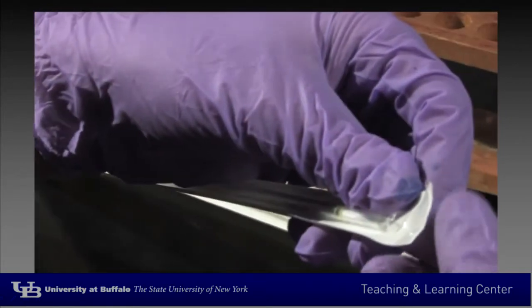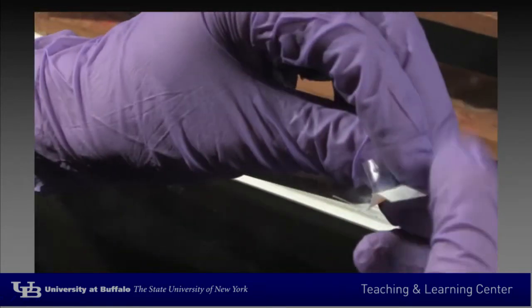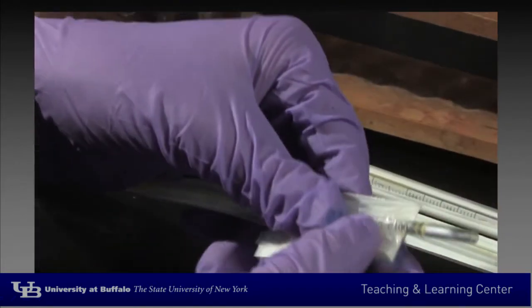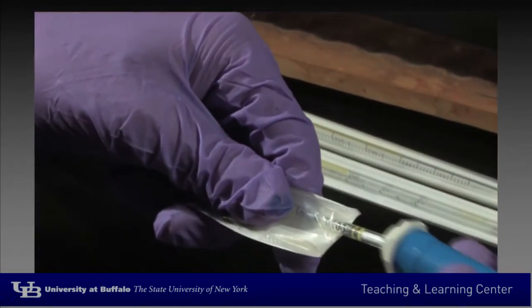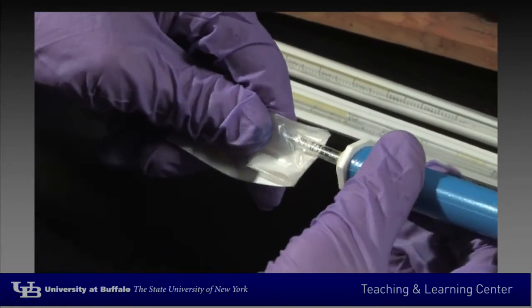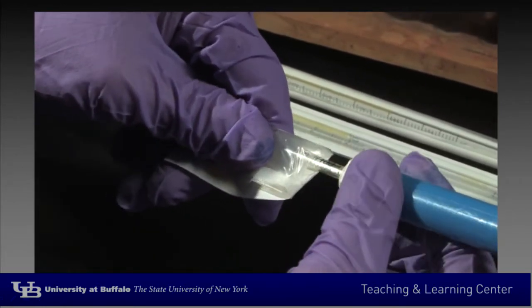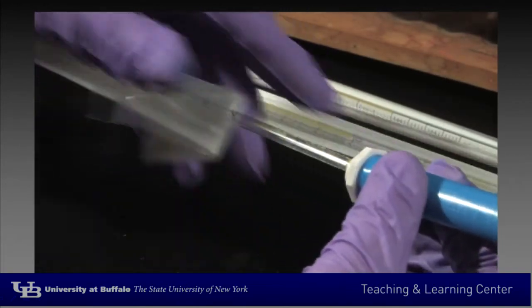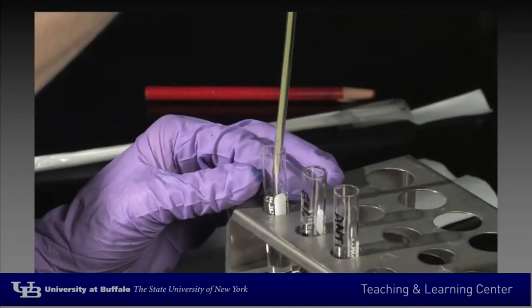To draw up and dispel the saline, you will be using a pipette aid. Remove the plastic from the pipette, which assures the sterility of the pipette, and place the pipette aid securely on the pipette by rotating it a few times onto the top of the pipette to assure a tight fit.